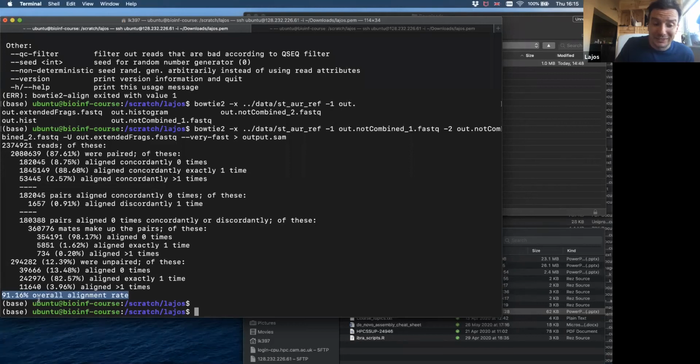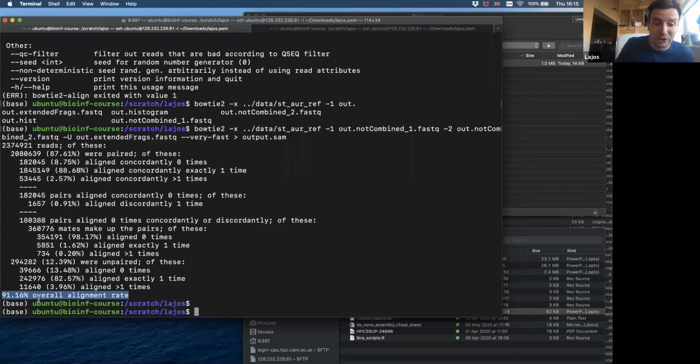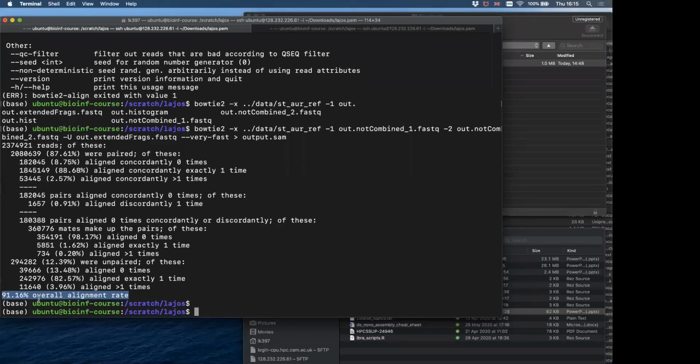I don't know, Ibrahim, if you know anything about these isolates, but I can imagine that they have plasmids in them. I know that they have AMR genes. I don't know how many of them are on plasmids, but I can imagine that there are plasmids in these. Yeah, I think the difference would be the AMR genes. Yeah, not just the genes, but probably plasmids, so mobile genetic elements.